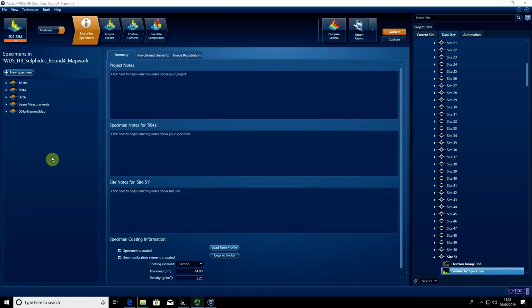Using feature, we can image an area of a sample, usually in backscatter electron mode, and we specify a threshold above a certain brightness. If we identify features that are brighter than that threshold, then we tell the system to automatically measure the chemistry of those features. Often we run overnight, and it's necessary then to process the data and come back in the morning.